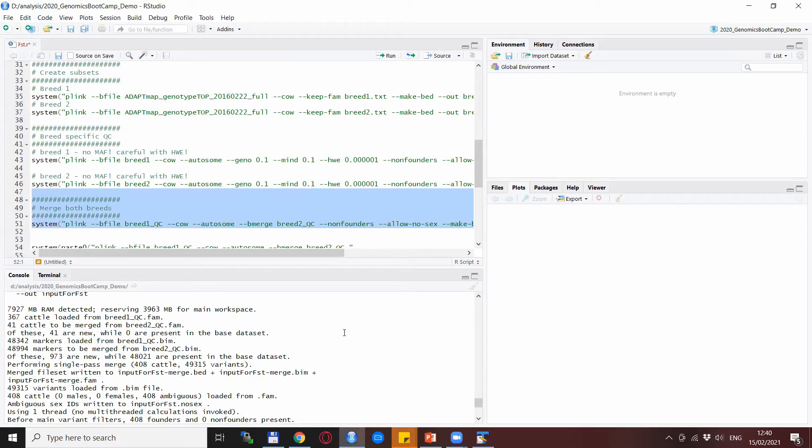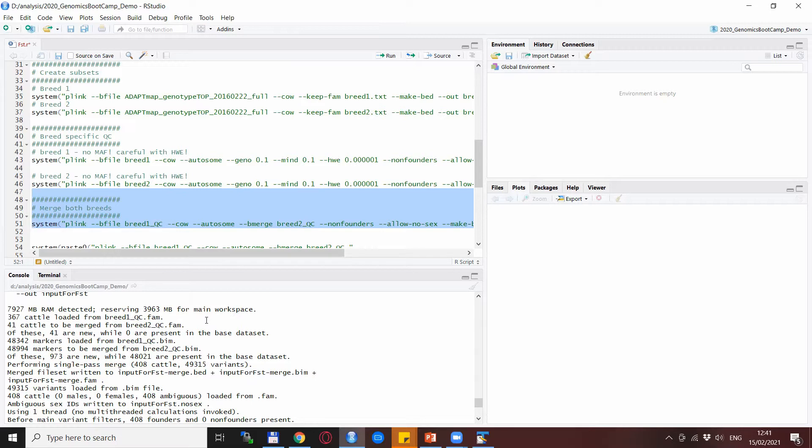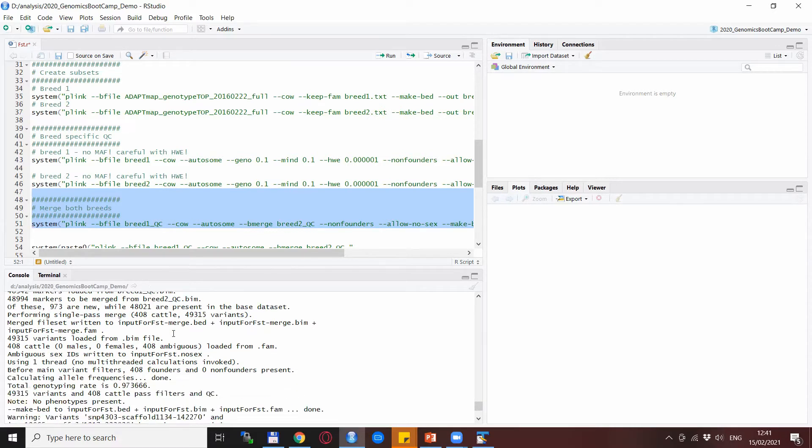The next step was the merging where we actually have the input from the two data sets, from the Angora and Gumus, and also for the two different SNP sets. What the merging does is it joins the animals together and also the markers together, so we end up with 408 goats and about 49,000 variants.